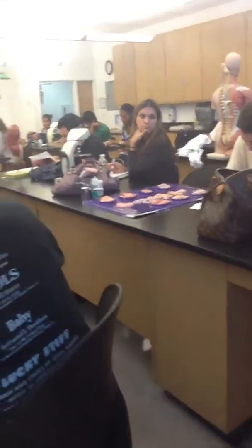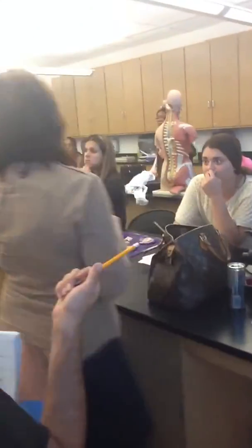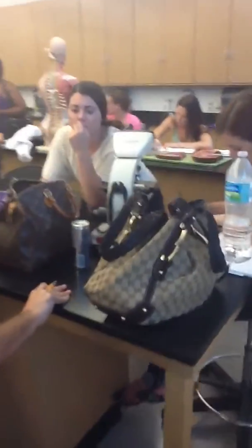17 is the cecum. Okay, so we already finished with the 18. 19, what is 19? Let me think about it. Right here. Oh yeah, this is a slide. Testis on that slide.